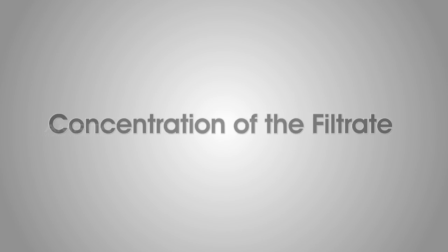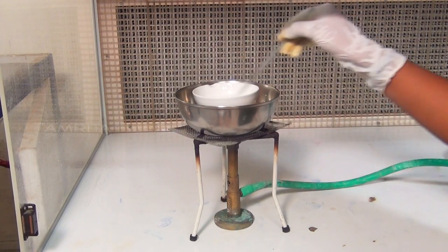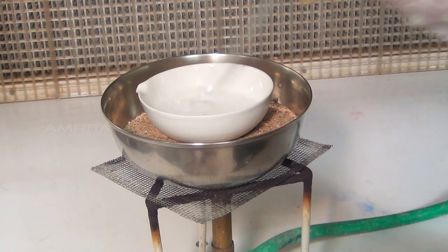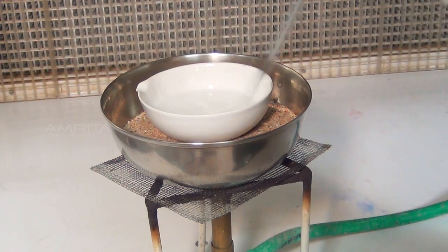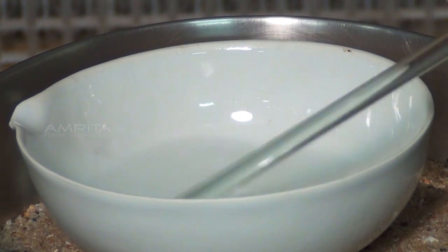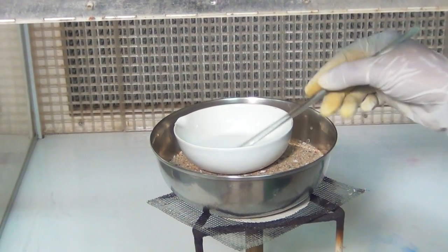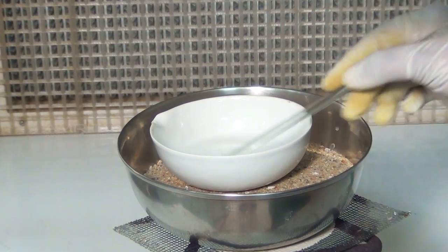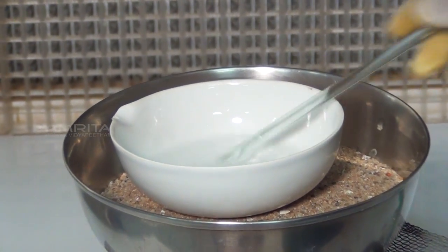Concentration of the Filtrate. Heat the china dish in a sand bath till the solution is reduced to about one third of its original volume. To avoid crust formation on the sides of the dish, stir the solution continuously with the glass rod.